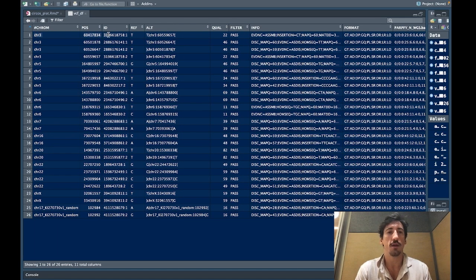Each line here represents one structural variant that SvABA has identified. I'm going to focus on one of these, in particular this one in row 19, as this is the one that affects SMARCB1. Since this is a rhabdoid tumor sample, which is known to have SMARCB1 alterations in it, I'm going to walk you through how I interpret this data and how you can apply this to understand which genes are actually being affected. So that's what we're going to do next.